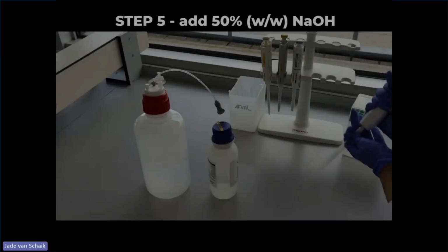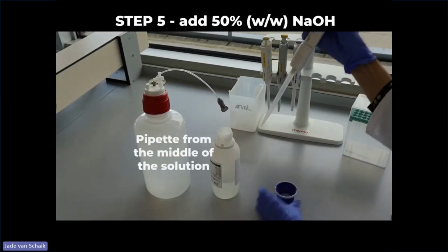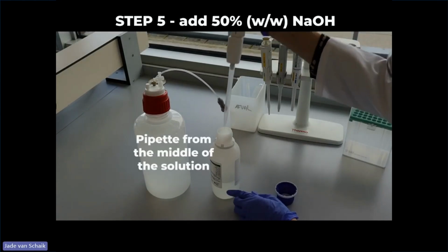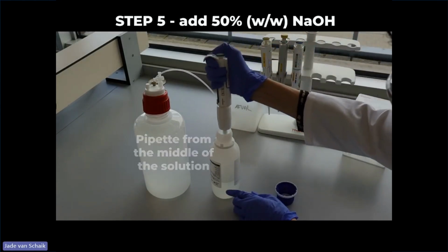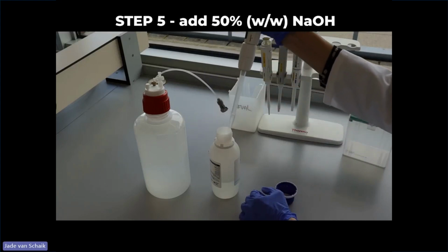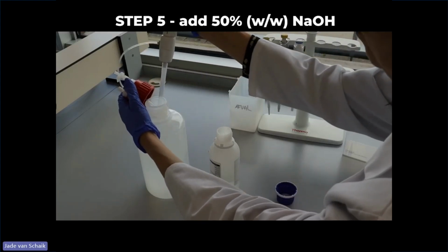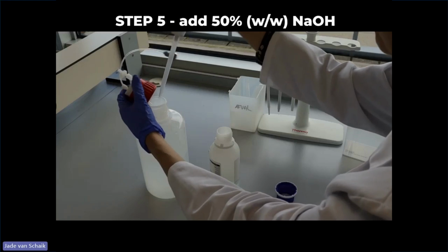The next step is to add the sodium hydroxide. Draw the solution from the middle, as there is the least amount of carbonates. Add the solution to the water and quickly close the cap again.